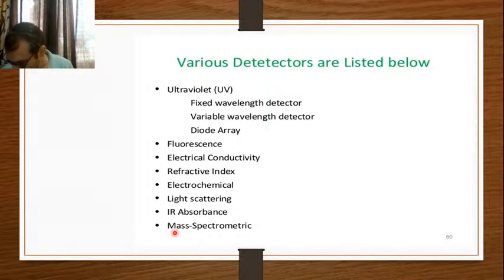Yes, Shraddha says separation between the two phases. It's not the separation, okay? Yes, Akash, variation in the composition of the mobile phase is what your gradient elution is. That's all. You are dealing with a variety of mobile phase compositions at a time in a single analysis, and that is called gradient elution.